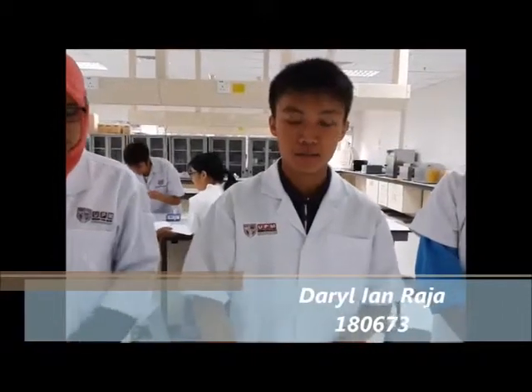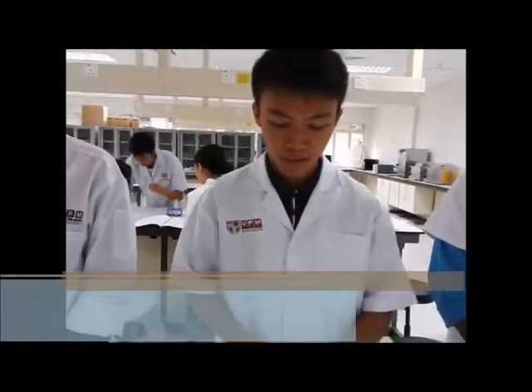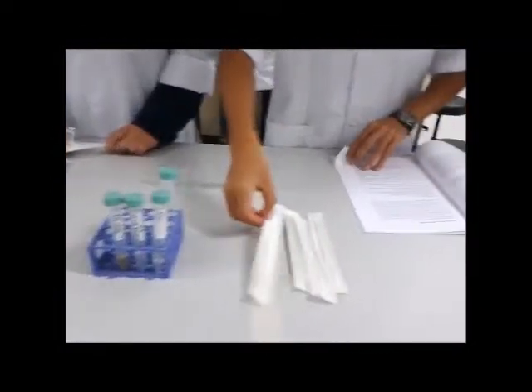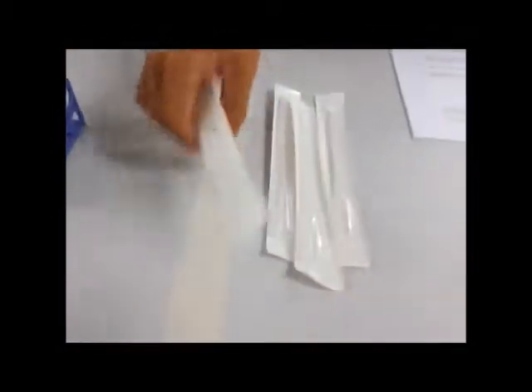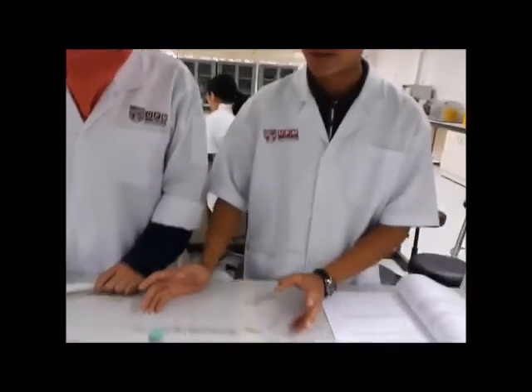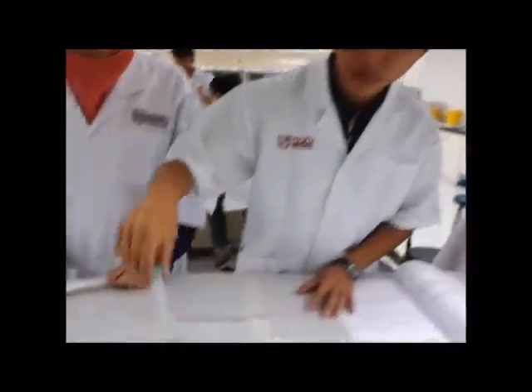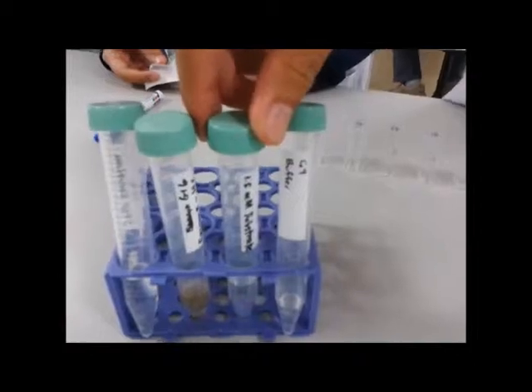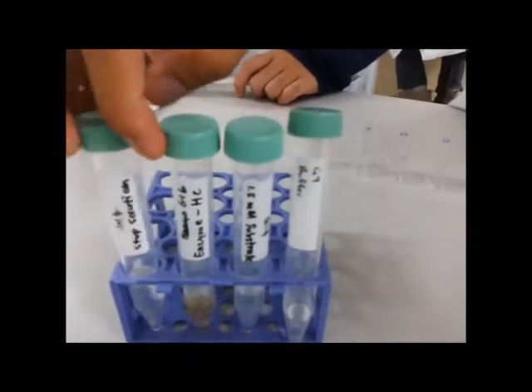So we are group 16 and we will be doing our practical on enzyme kinetics, which is the experiment of determining the reaction rate in the presence and absence of enzyme. So here we have our materials, which are firstly the disposable plastic transfer pipette, and we have our cuvettes, which are 7 of them. And for our materials, as you can see, we have the buffer, the substrate, the enzyme, and also our stop solution.